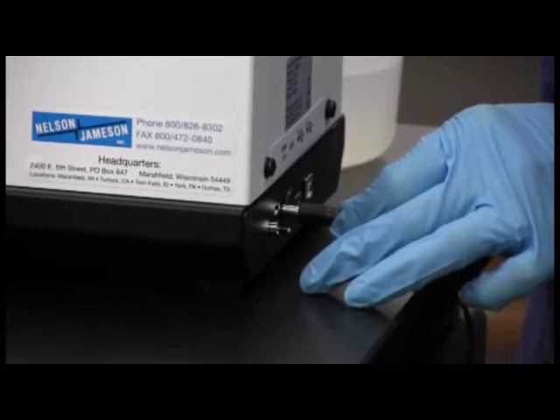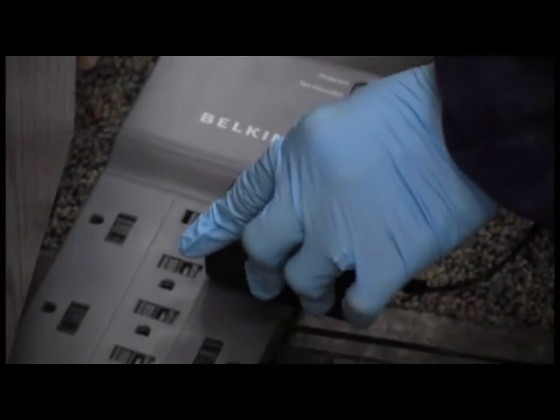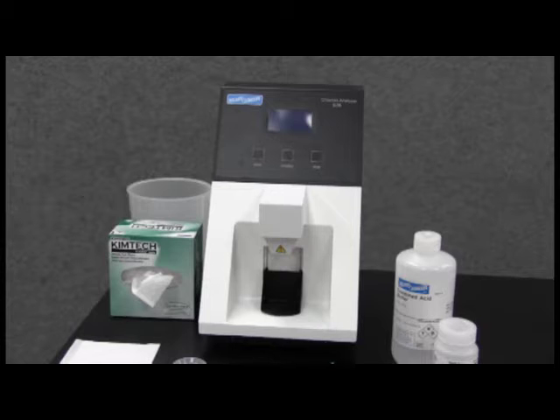Connect the AC adapter to the analyzer first, then to a grounded power source, and switch on the instrument. Allow five minutes before use.